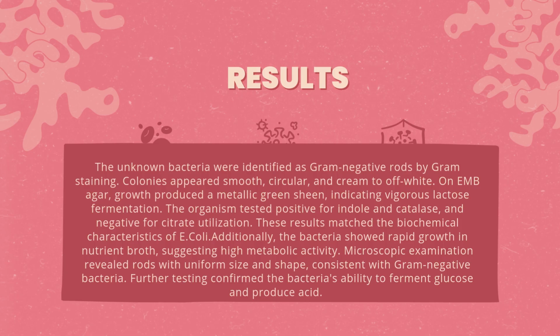Microscope examination revealed rods with uniform sizes and shapes consistent with gram-negative bacteria. Further testing confirmed the bacteria's ability to ferment glucose and produce acid.